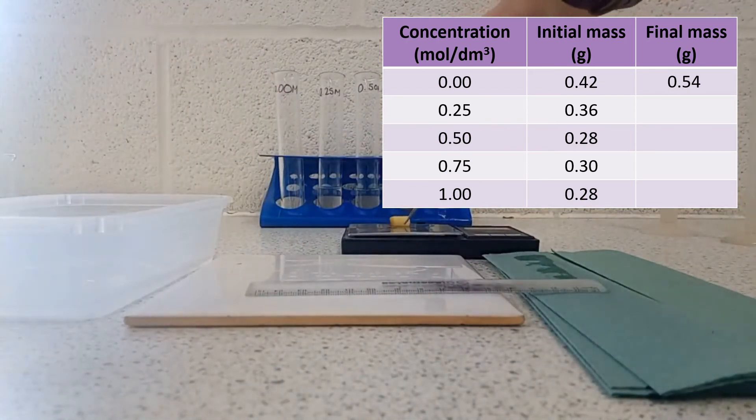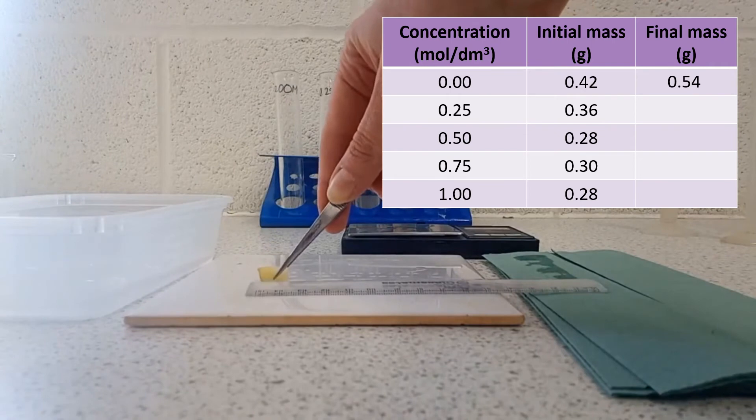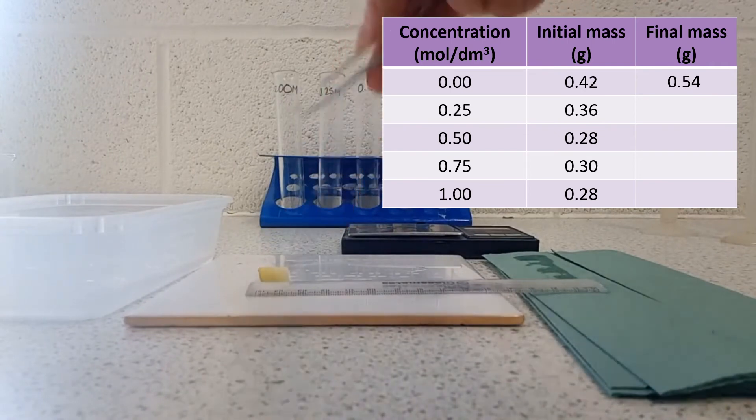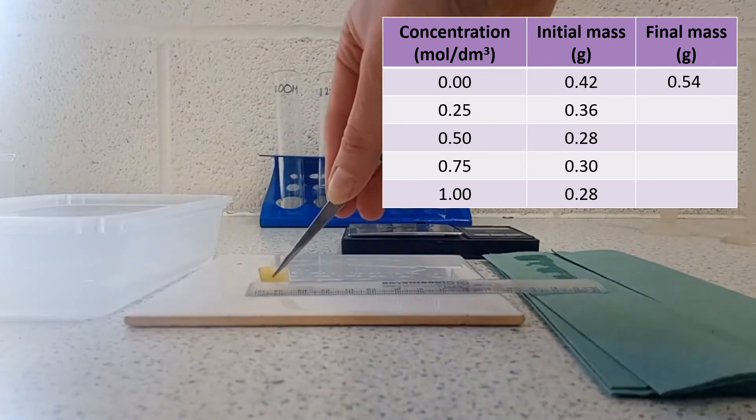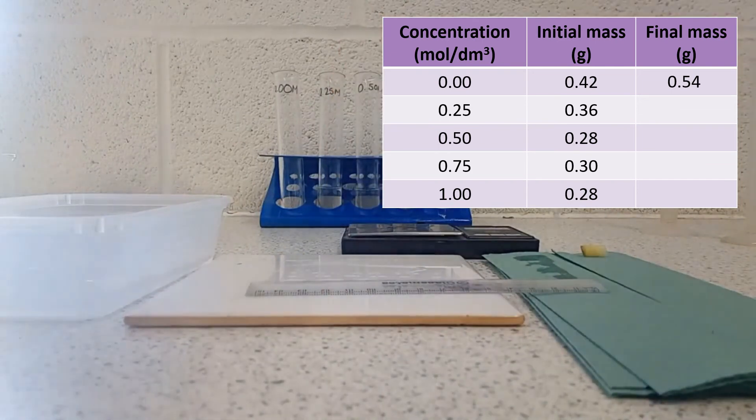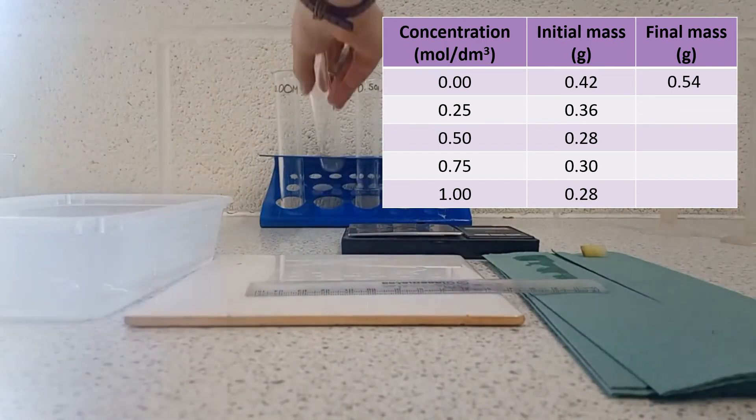Also, I can compare it to my ruler and see that this is no longer 10 millimeters long. It's more like 12 millimeters, so it's got a little bit longer, and that's what we would expect because the cells have swollen, and so the whole piece of potato has got a little bit larger.